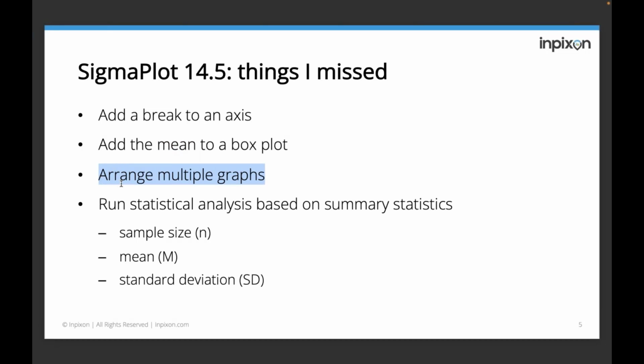You can arrange multiple graphs very easily with SigmaPlot. So you have a page where you can arrange multiple graphs at once. Like you saw maybe in some papers where they have not only one plot per page, but they have 4 plots, for example. You can create this with SigmaPlot as well.